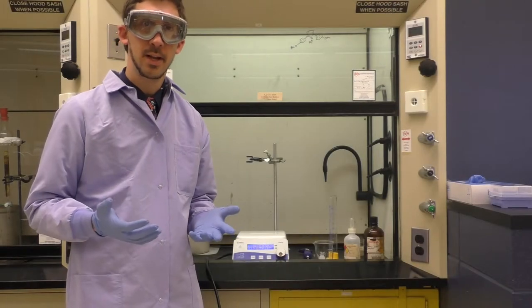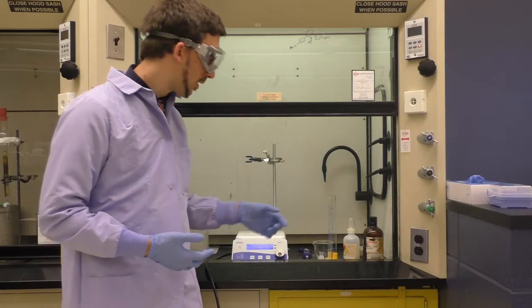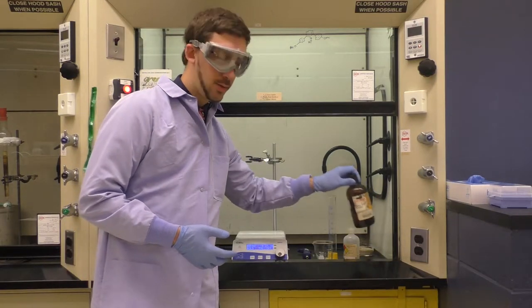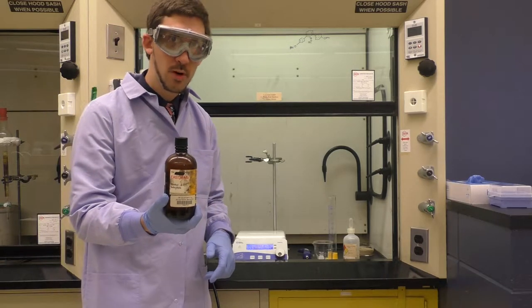So here we are ready to begin part one of the synthesis of aspirin. And so we're going to start with the natural product, the oil of wintergreen, otherwise known as methyl salicylate. And I'll measure out 4 milliliters of this.